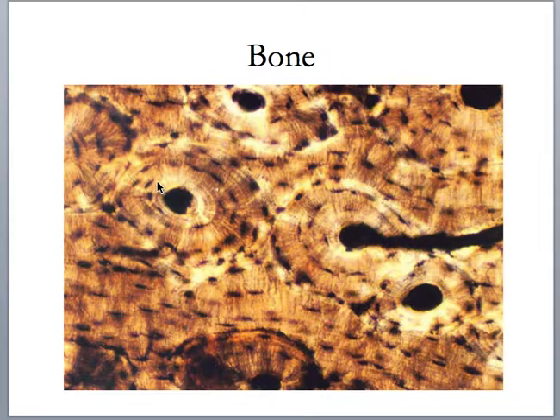All right, but if you look, these concentric circles are running in this direction around the central canal. With the osteocyte, if you look, there are these little tiny feather-like projections, and they're perpendicular to those concentric circles. So they're radiating out that way, okay? Those little channels that are coming off the osteocytes have a special name called canaliculi. Canal, and iculi is referring to the fact that they're little tiny canals, little tiny channels.